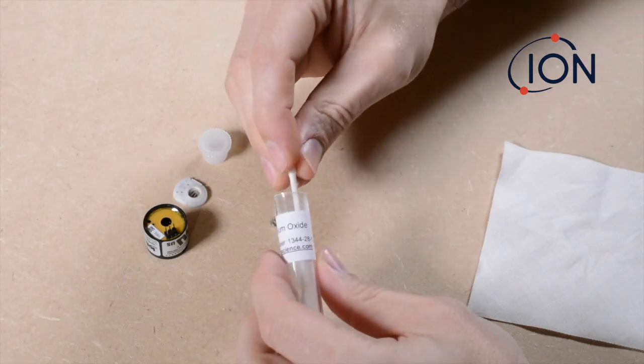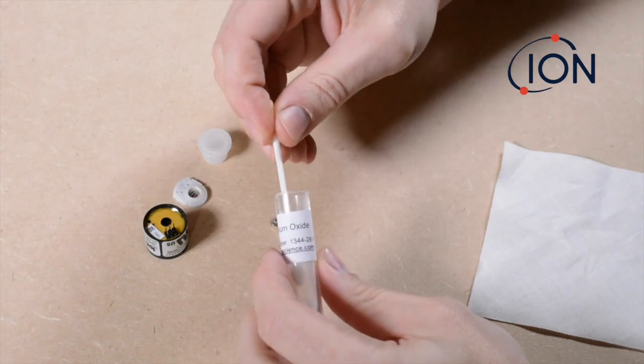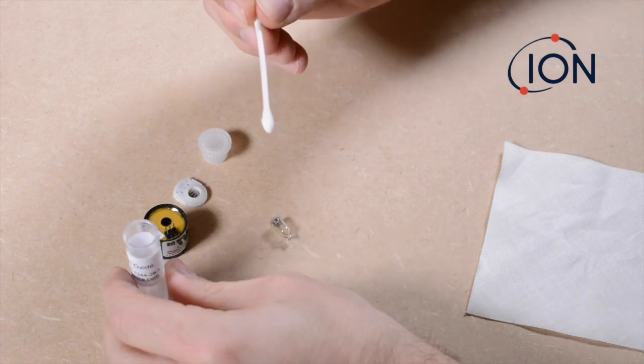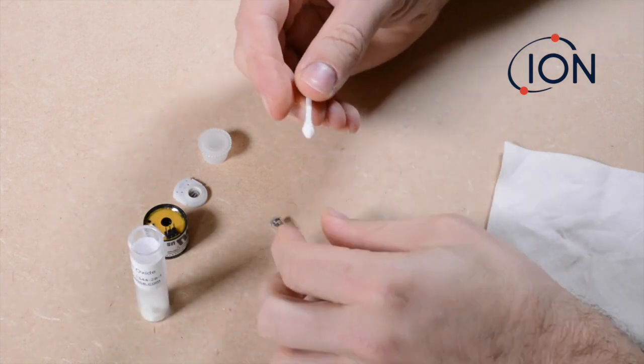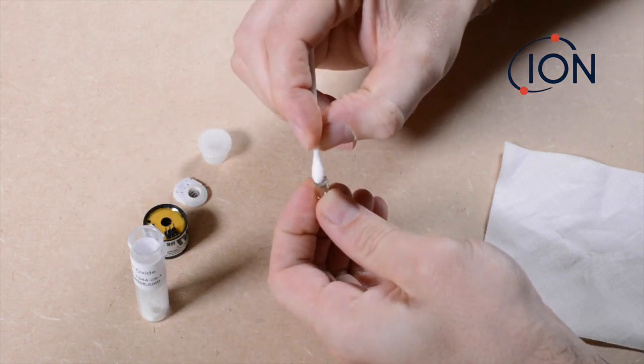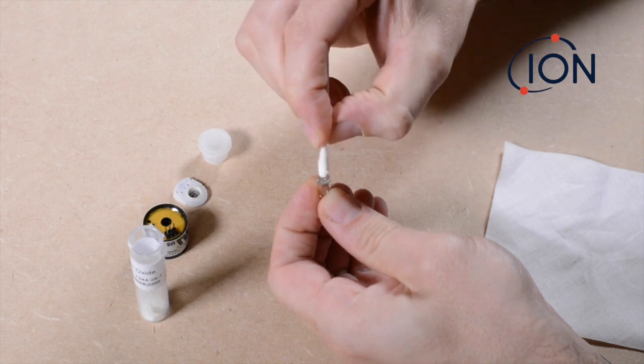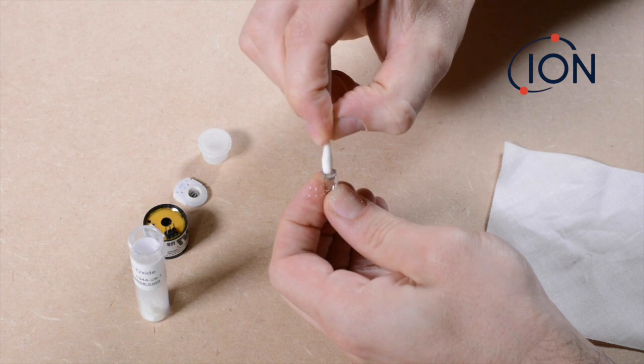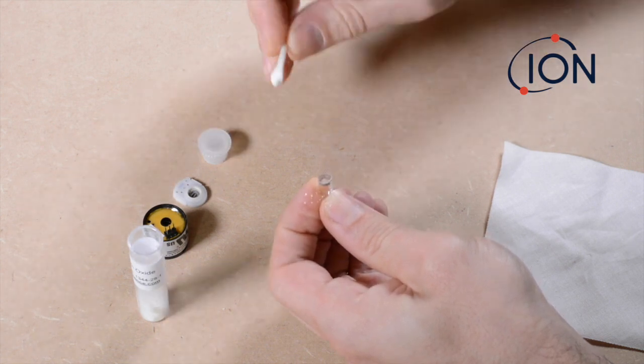Dip a clean cotton bud into the aluminum oxide cleaning powder and lightly tap off any excess. Press the tip of the powdered cotton bud firmly onto the window of the lamp and rotate in circular movements.